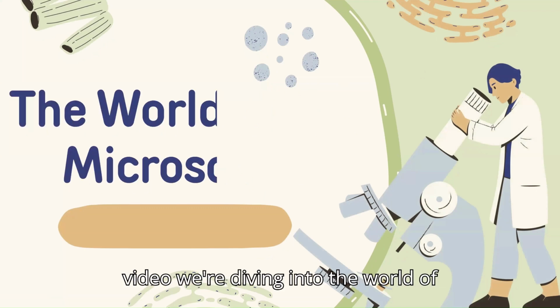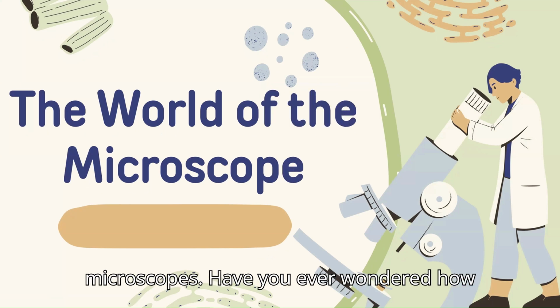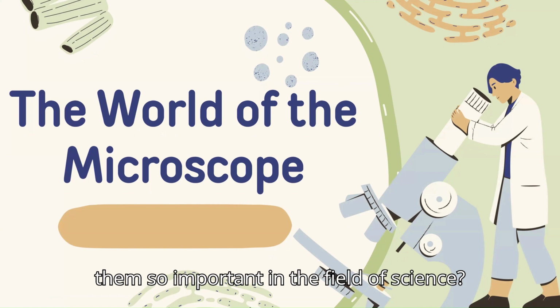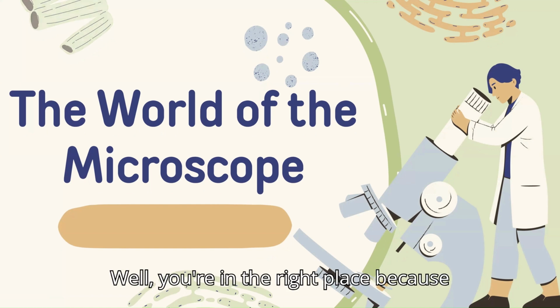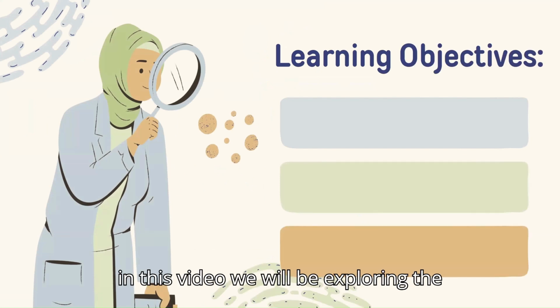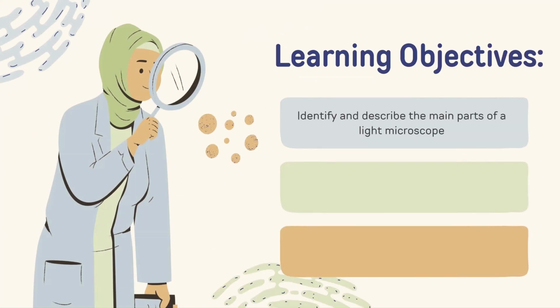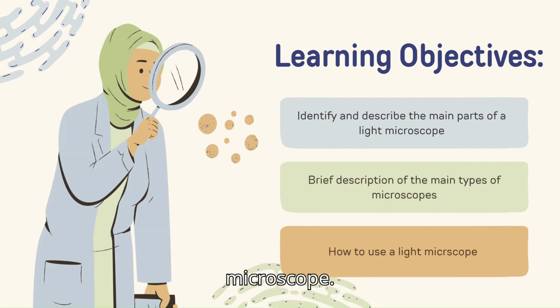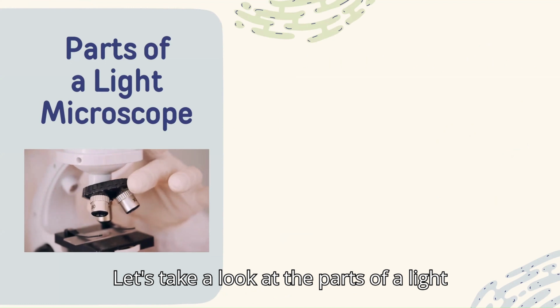In this video, we're diving into the world of microscopes. Have you ever wondered how these powerful tools work and what makes them so important in the field of science? Well, you're in the right place because in this video, we will be exploring the main parts of a light microscope, discussing different types of microscopes and learning how to use a light microscope. Let's take a look at the parts of a light microscope.